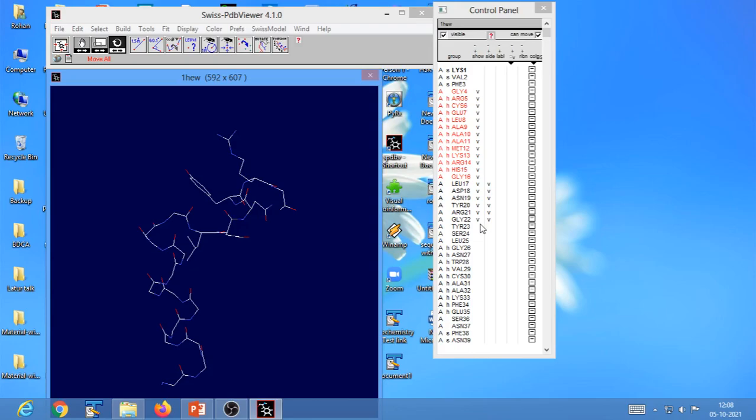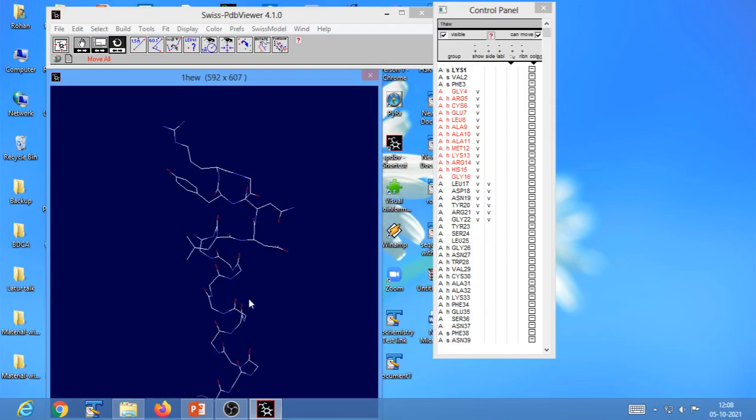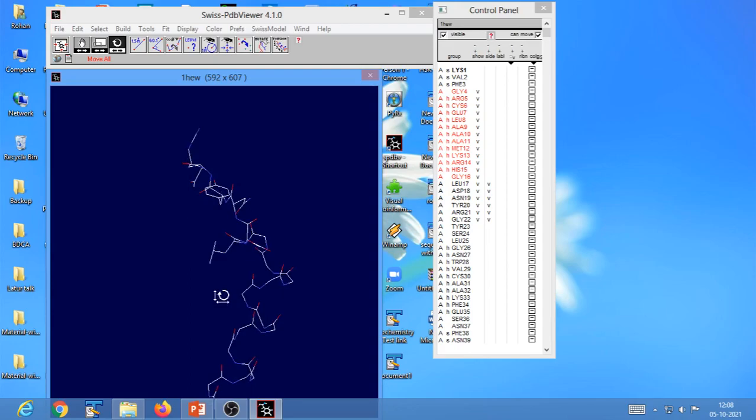Let me make this fact very clear: it is not necessary that whatever is displayed in your visualization window is necessarily selected, or vice versa. This is the fact that I want you to learn.